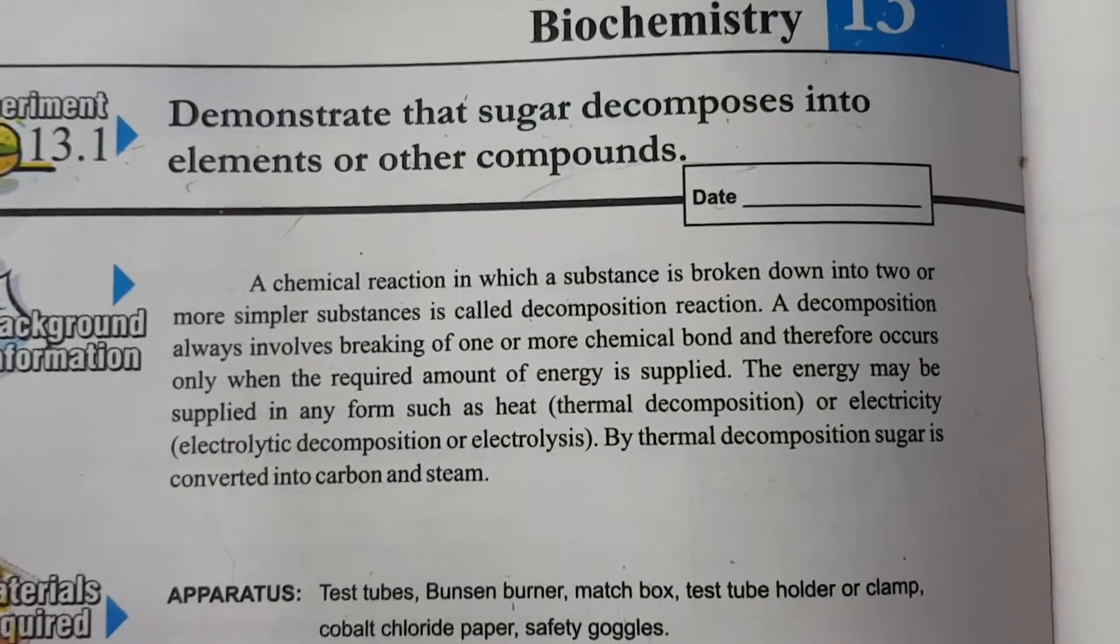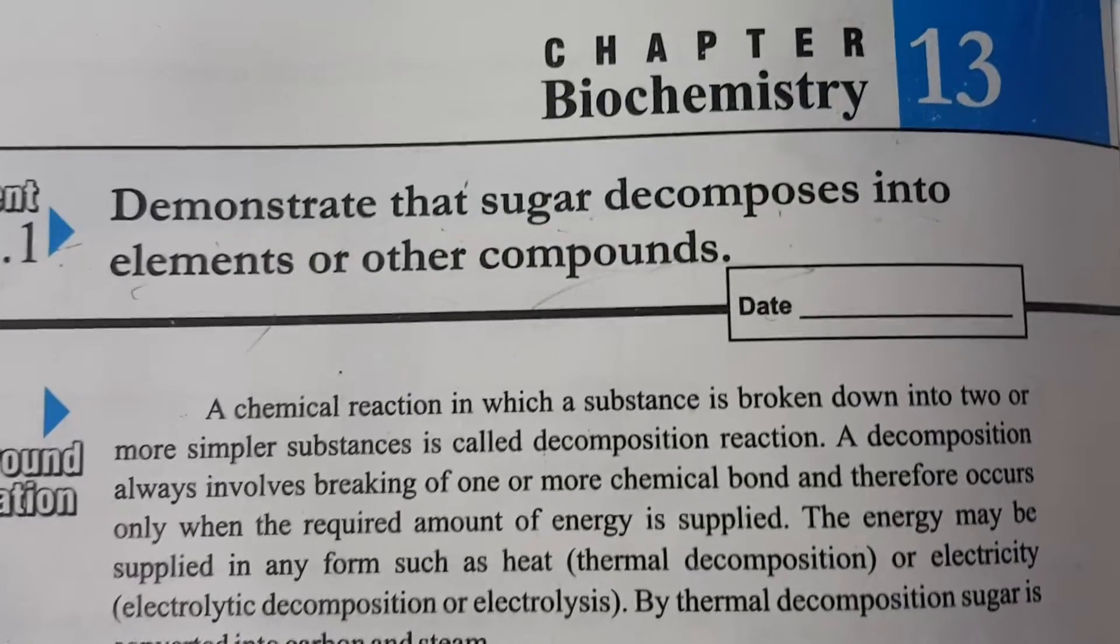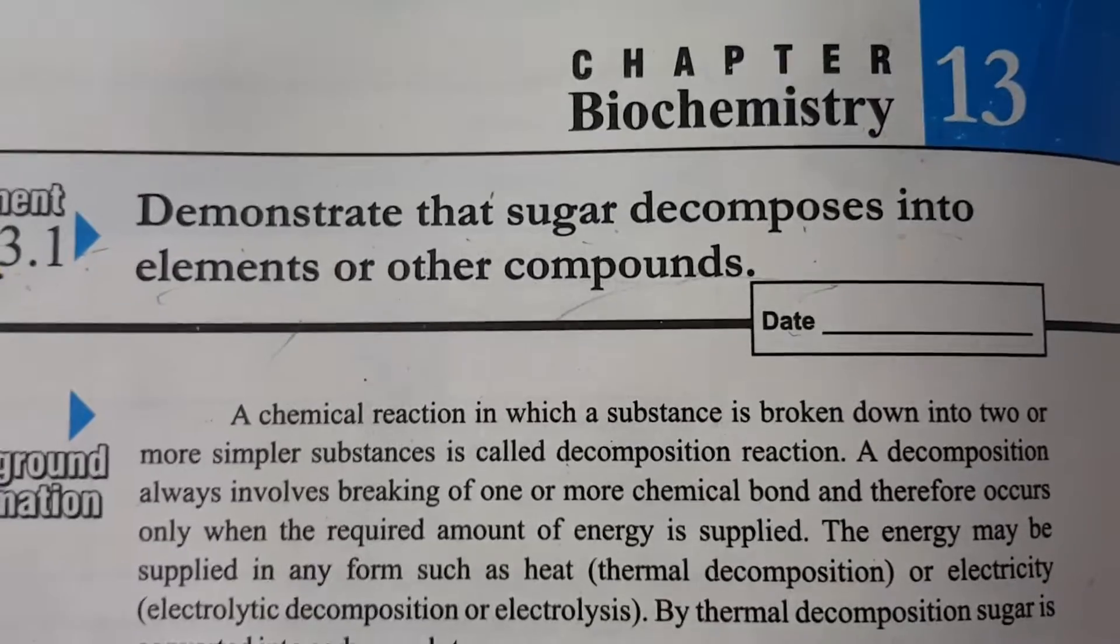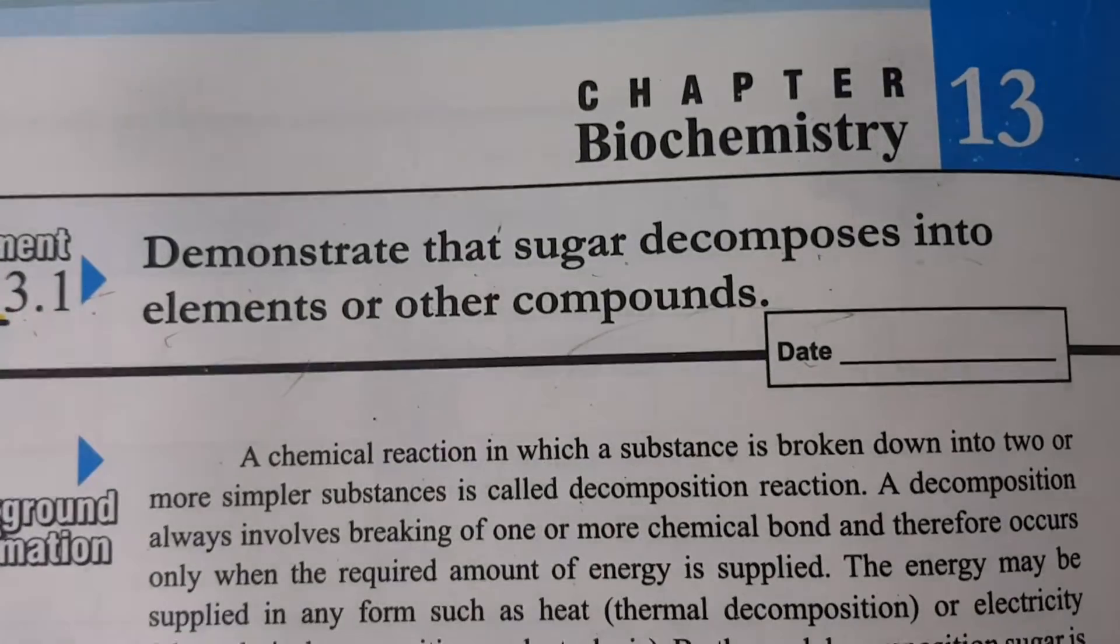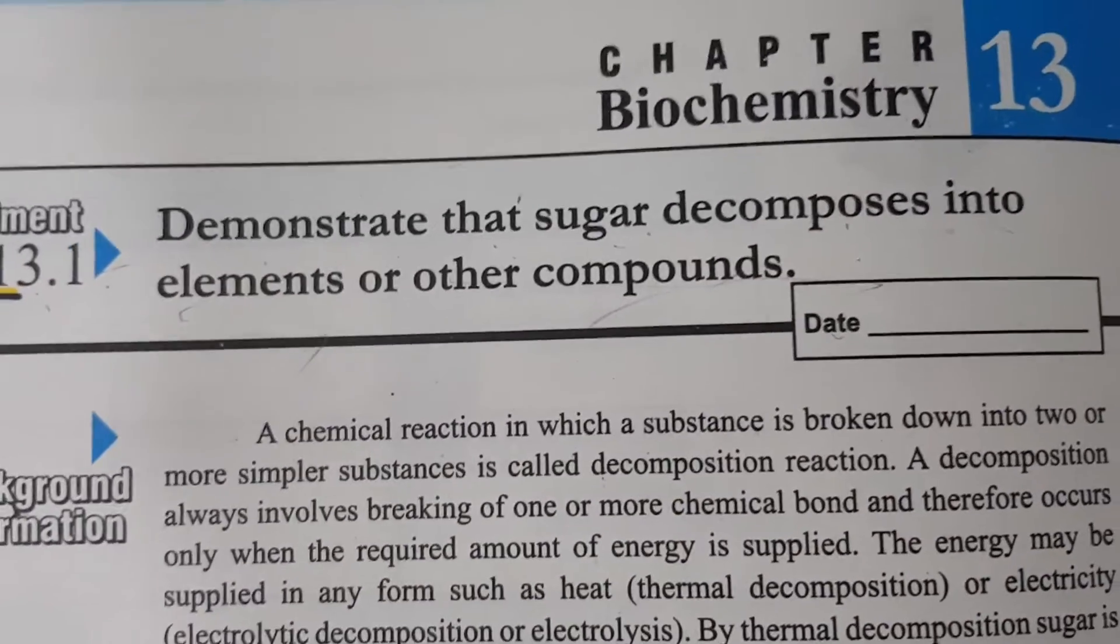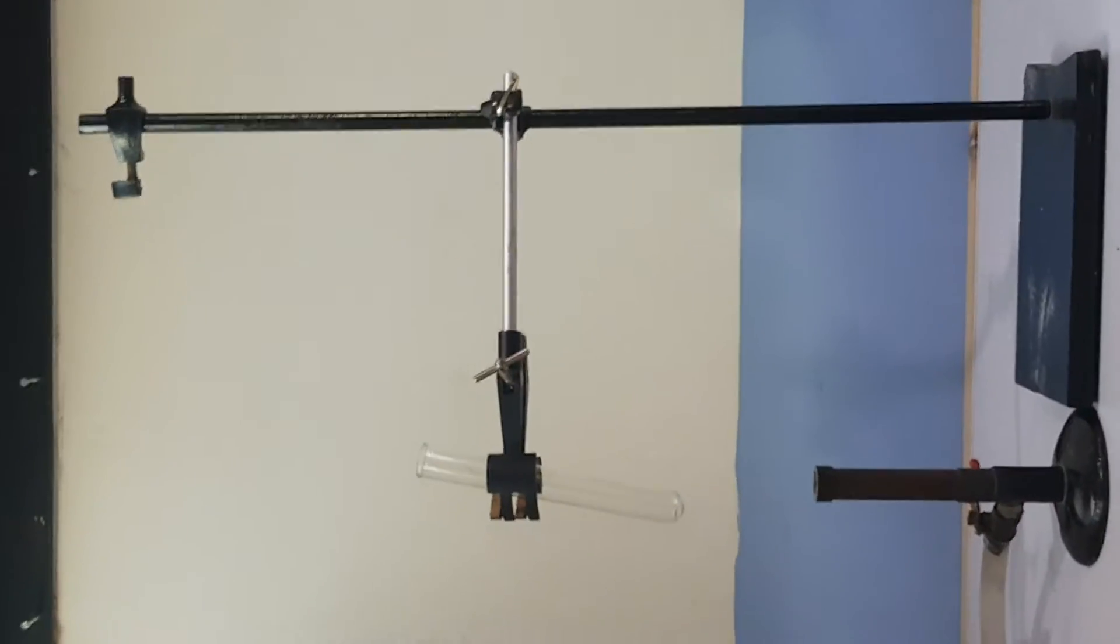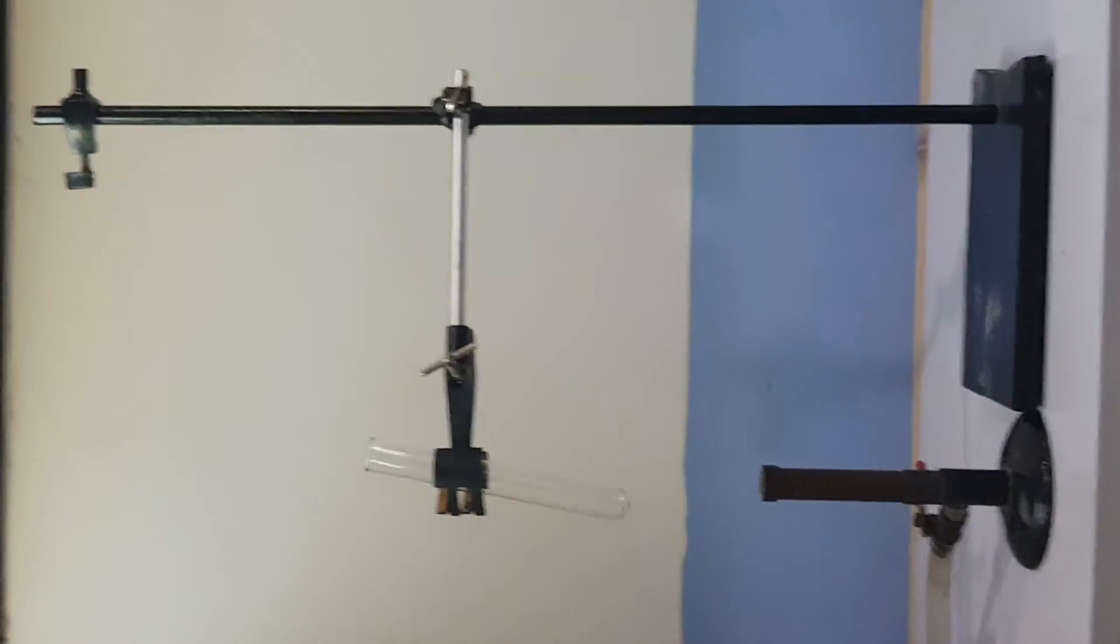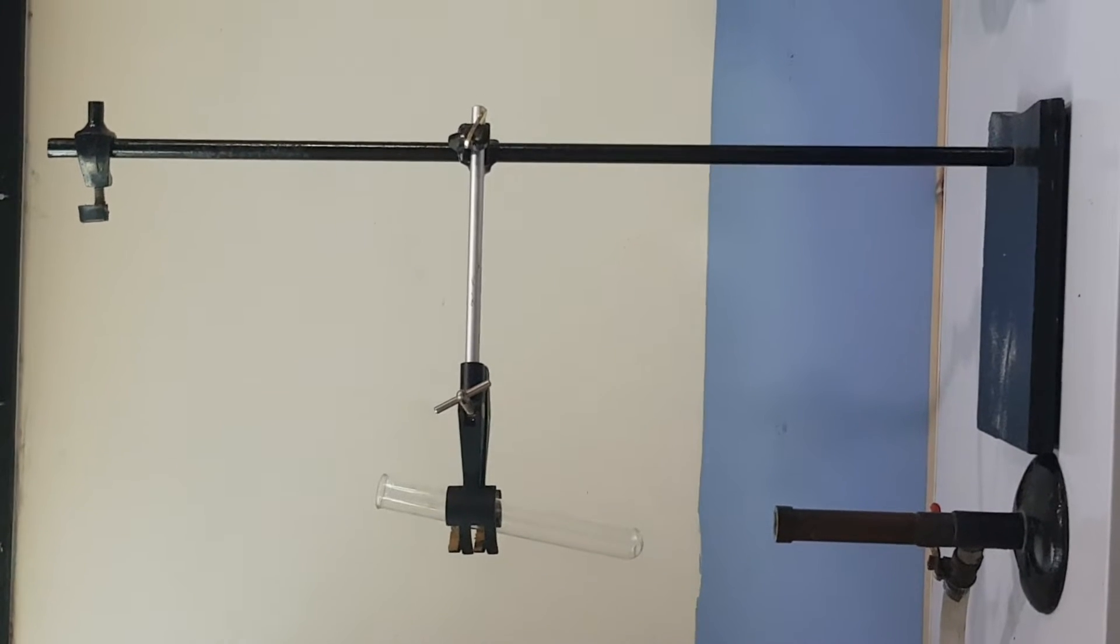In this experiment, we will demonstrate that sugar decomposes into elements or other compounds. For decomposition of sugar, we will heat it on the flame in a test tube. We will hold the test tube with a clamp on an iron stand.